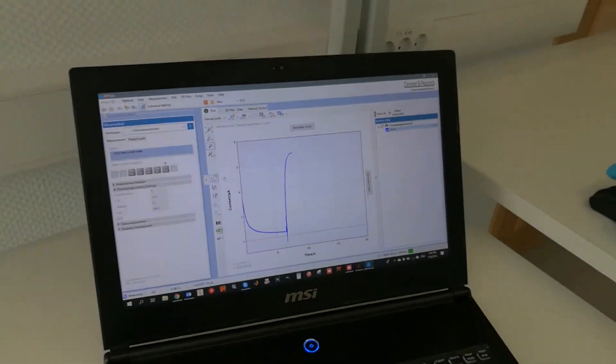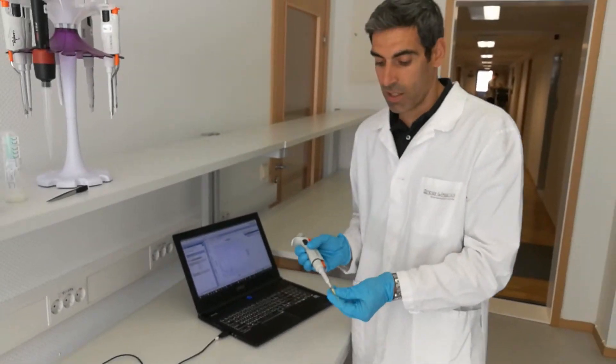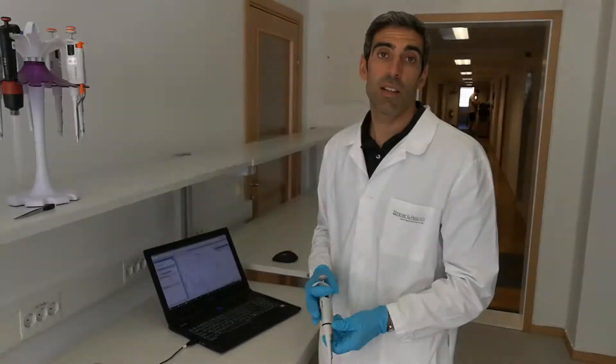So this is how we test our glucose sensors. You can do beaker test or drop test. In this case, I showed you a drop test. I hope this helps you with your testing. If you have any questions, please don't hesitate to contact us. Thank you.